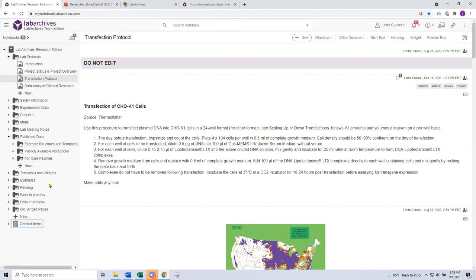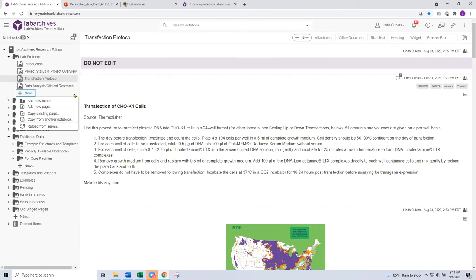Within the structure of the notebook, you'll notice a series of plus symbols or new menus. That is where you start to build out the structure. This is where you have the opportunity to add a new page, add a new folder, and importantly the ability to copy materials over. You might need to copy a protocol that's in another notebook, or maybe your lab has created another notebook just for managing protocols — this gives you access to copy over content based on your level of access.